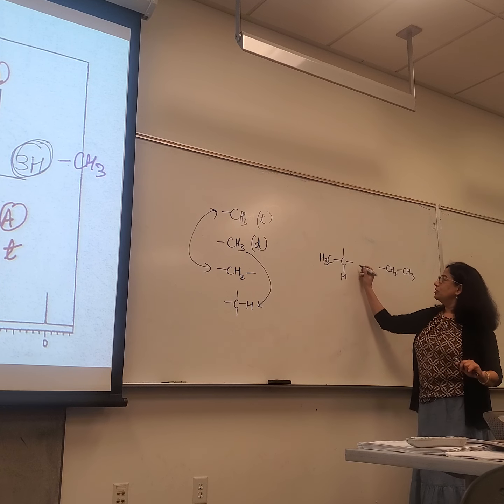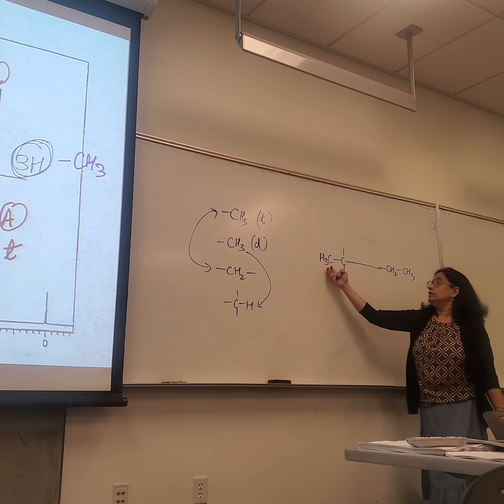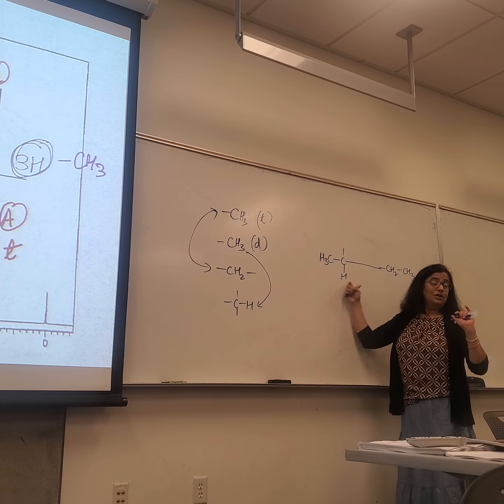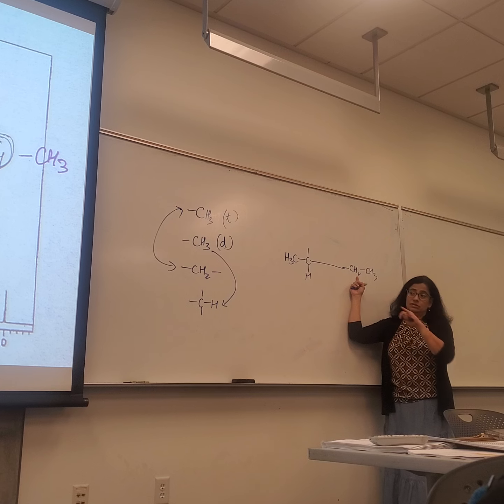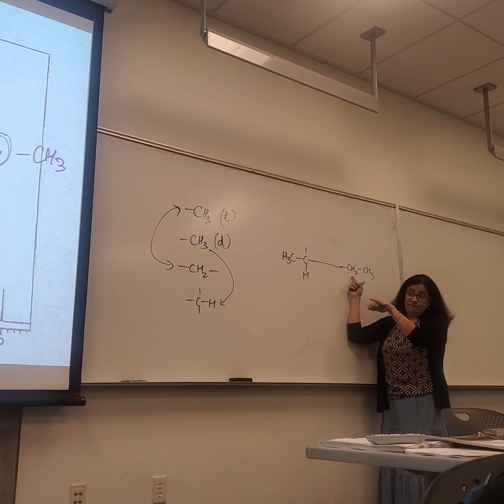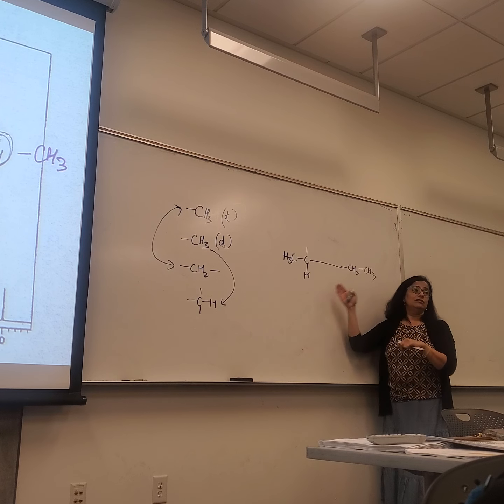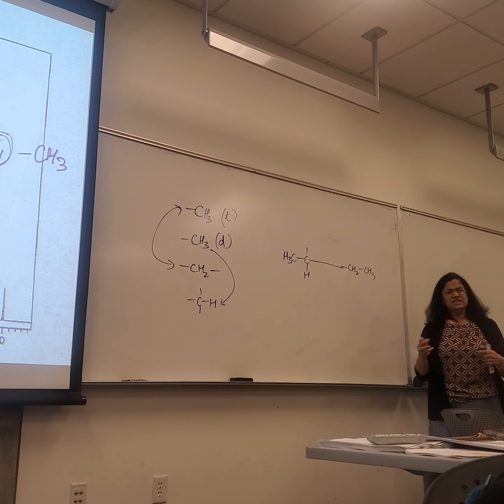So would it be okay for us to connect these two? 2 plus 3, has 5 neighbors. Everybody okay? What's the multiplicity of CH2? What's the multiplicity of methylene? Pentet. So how many neighbors? 3 plus 1, 4 neighbors. Agreed? Yeah.